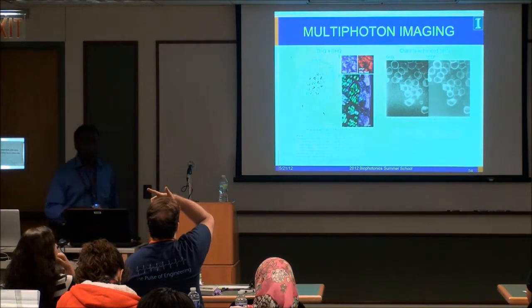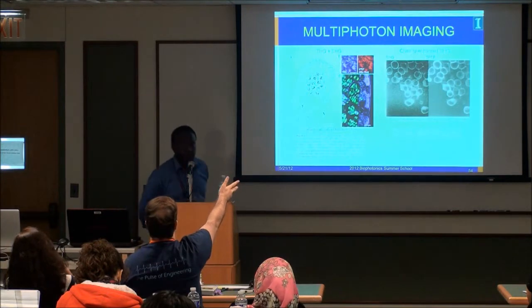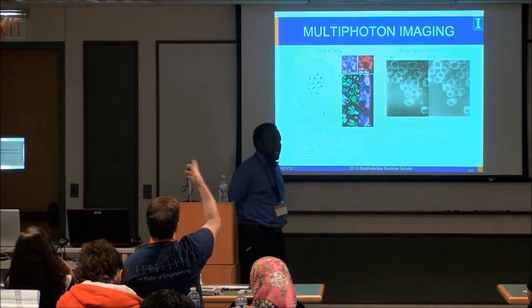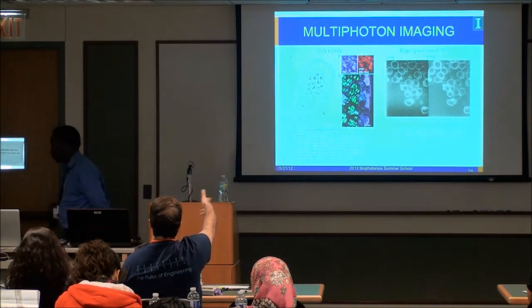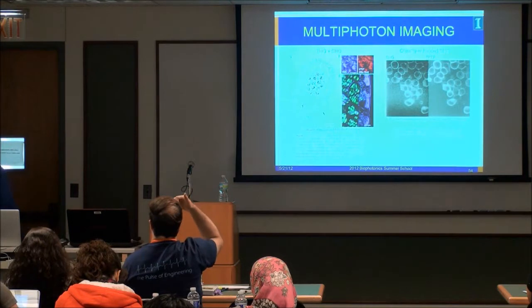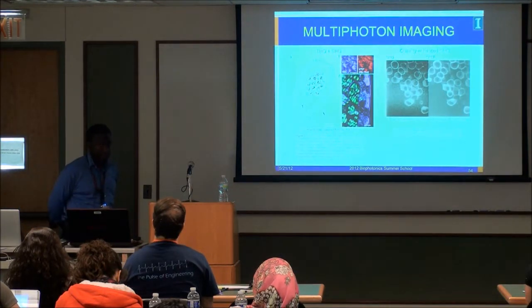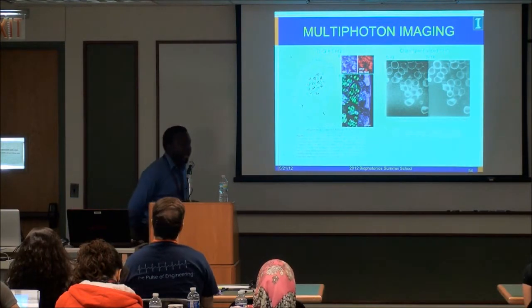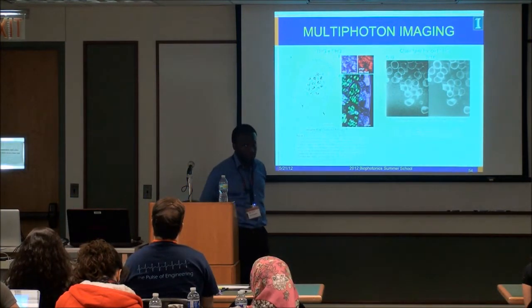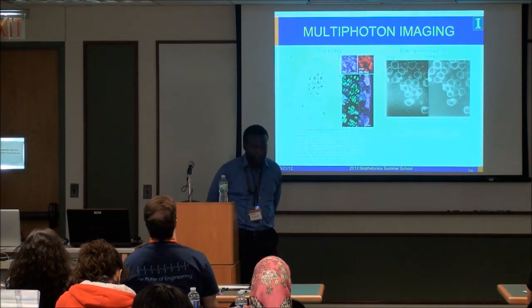So the second one gets taken off, from what I understand, over traditional two-photon fluorescence techniques for various reasons. I think one is deeper penetration depths, but also lower phototoxicity. Yep. But also the trade-off is SHG is orders of magnitude weaker than fluorescence in terms of signal strength. If you're looking at collagen fibers, the most highly crystalline collagen fiber is type 1, then it's cool. It works fine. But for inherent endogenous fibers. That's right.